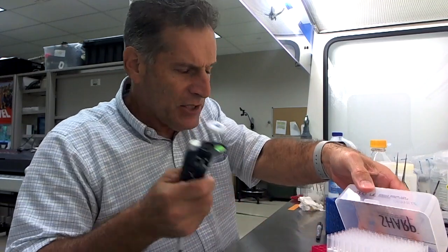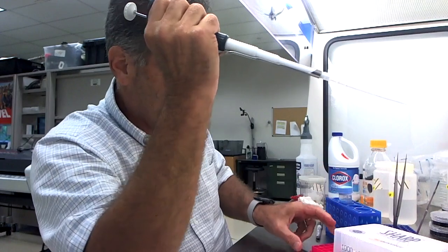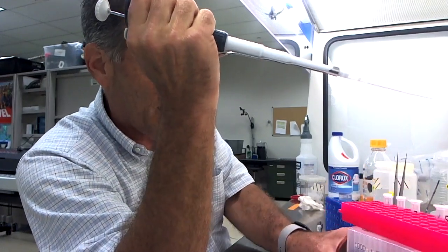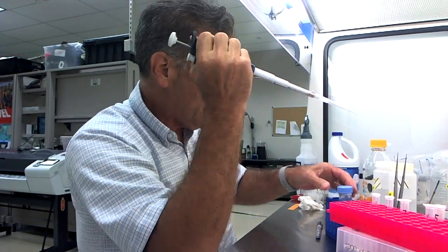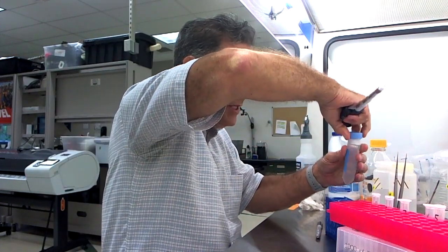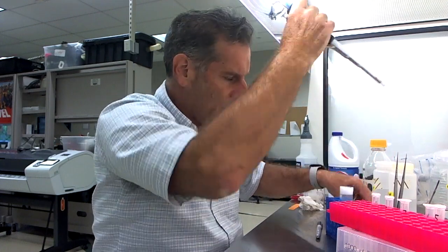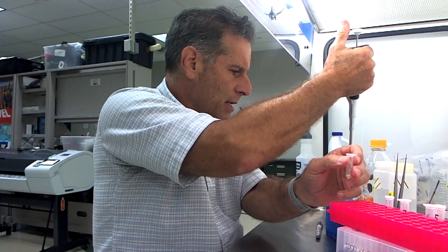These are all my different seeds. These tubes are two-mil tubes right here. What I'm going to do is take the bleach solution right here and just add it to each one of these tubes.